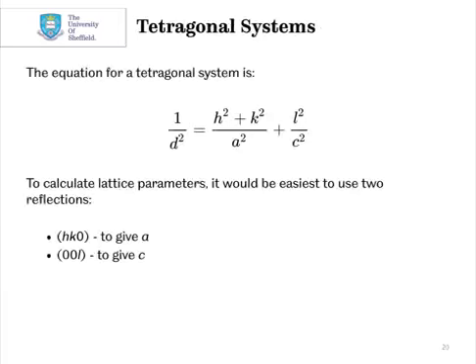The equation for a tetragonal system is a little bit more complicated: 1 over d squared equals (h squared plus k squared) over a squared plus l squared over c squared. So we have a separation here of the h, k, and then the l Miller indices. If we want to work out the lattice parameters from this, we're going to need an hk0 type reflection to give a, and a 00l reflection to give c. So for example, you might look for a 001 to find out what c is, and then a 110 to find your a lattice parameter.